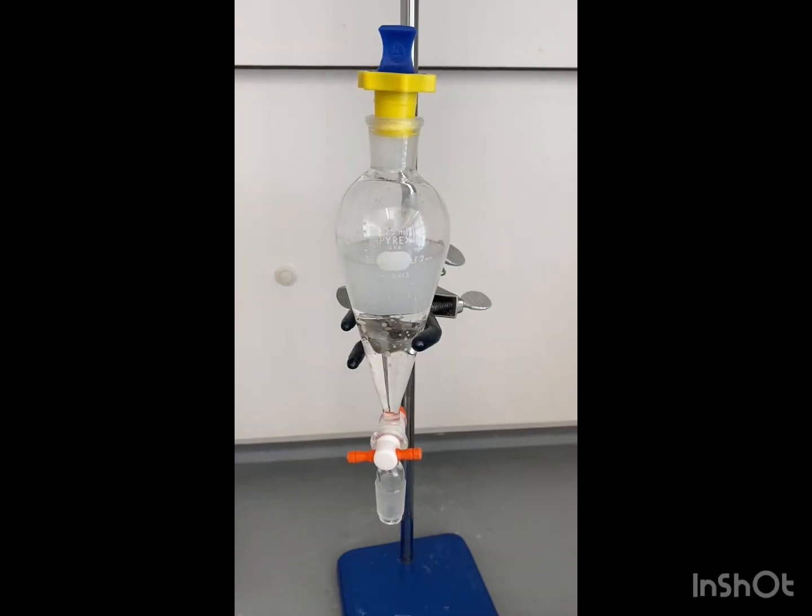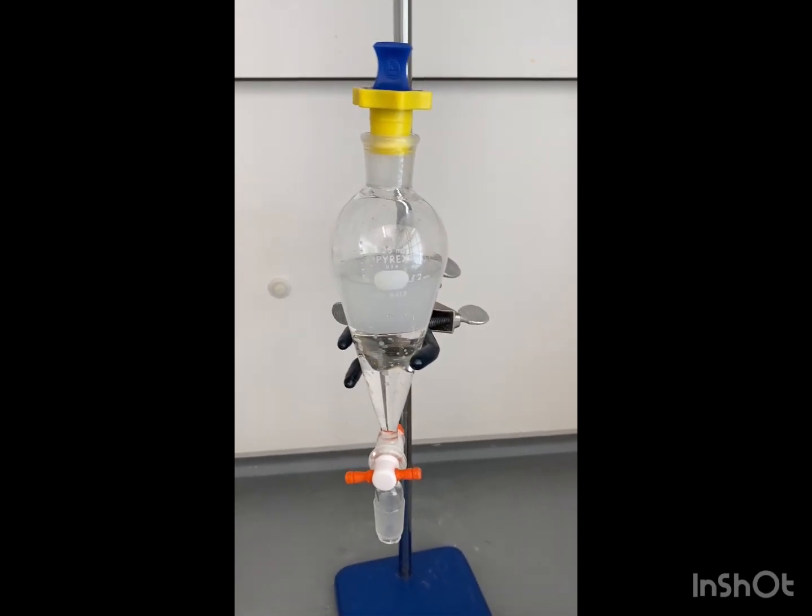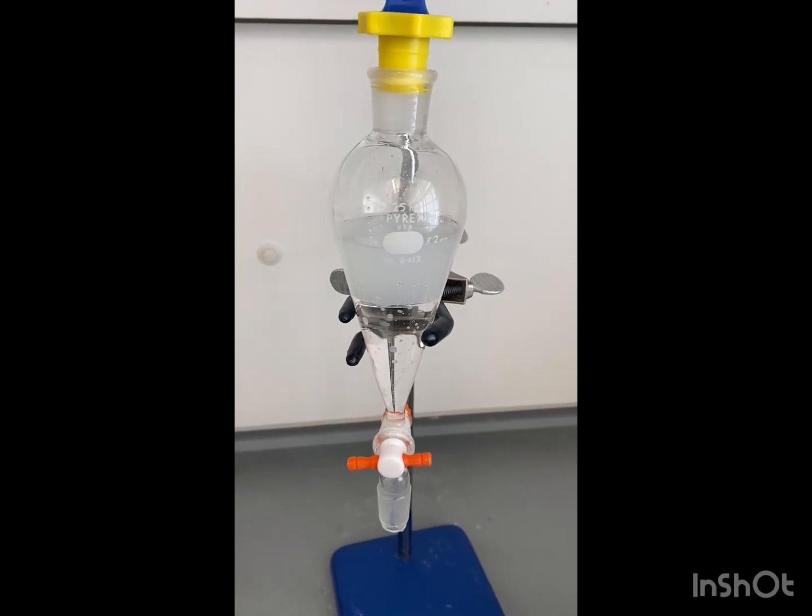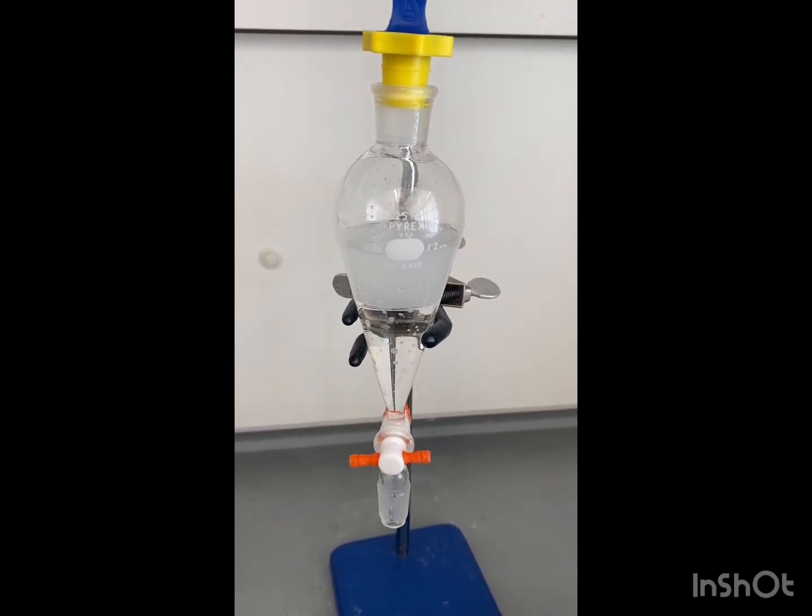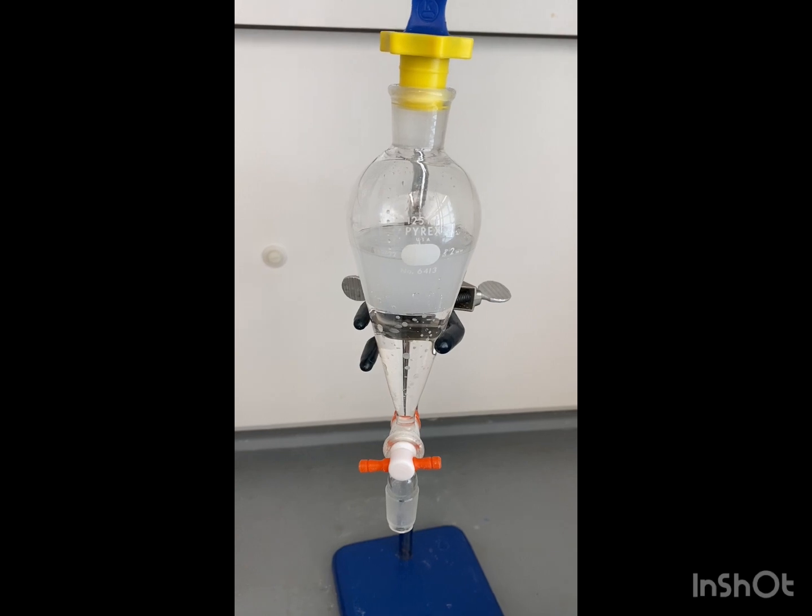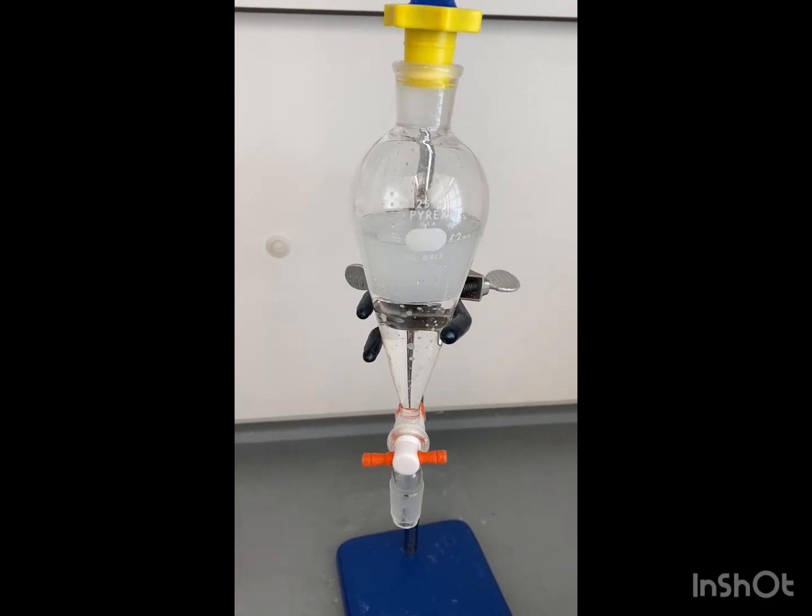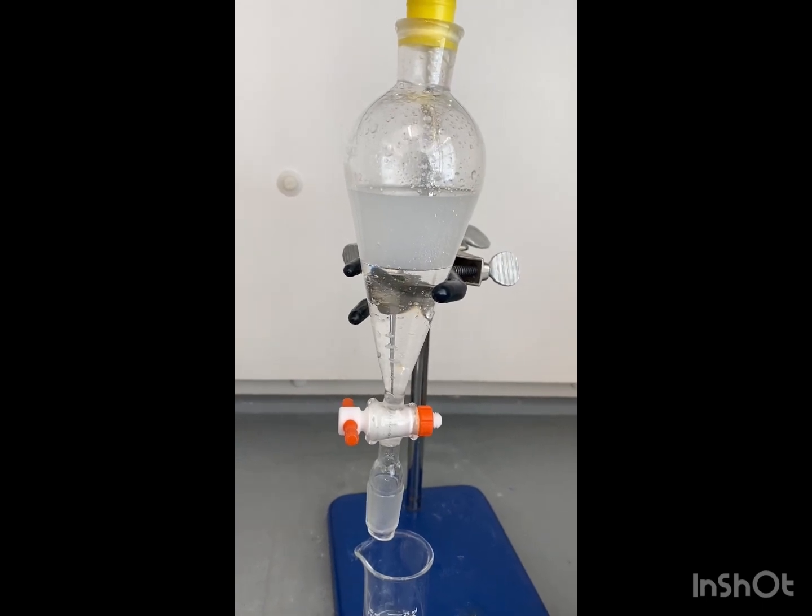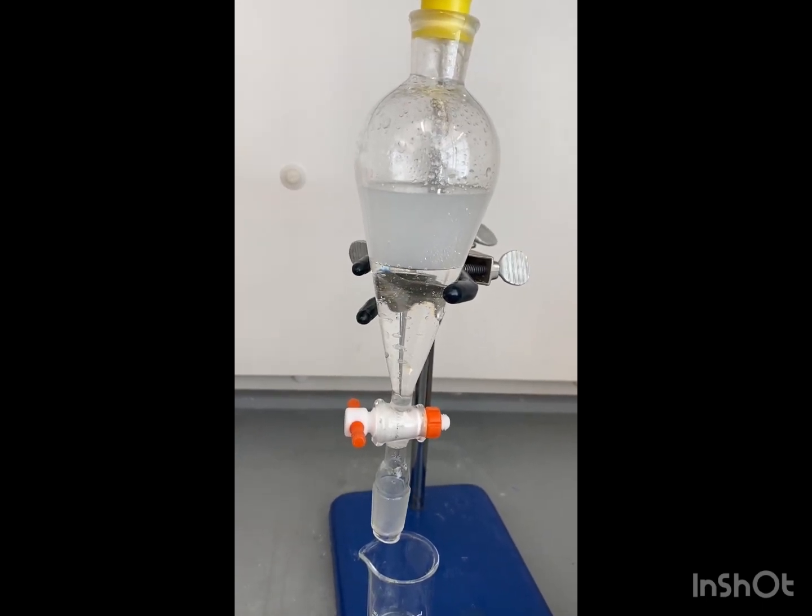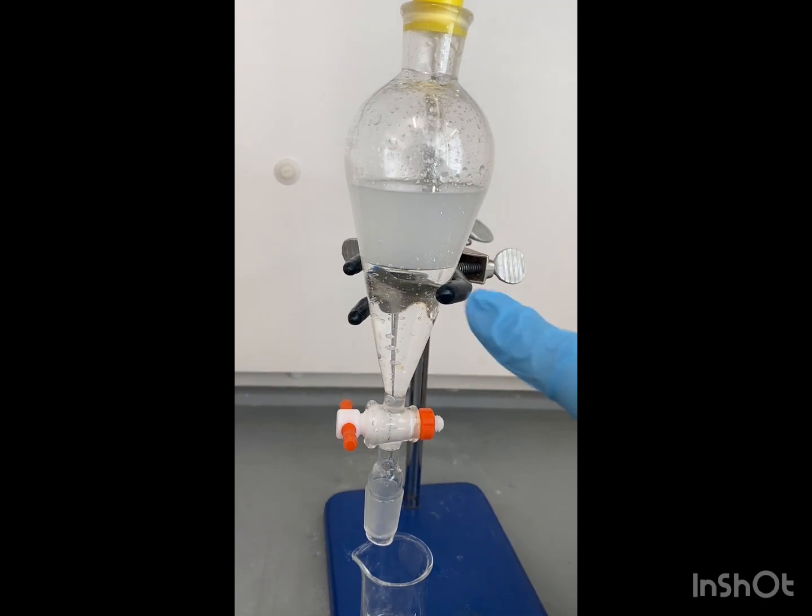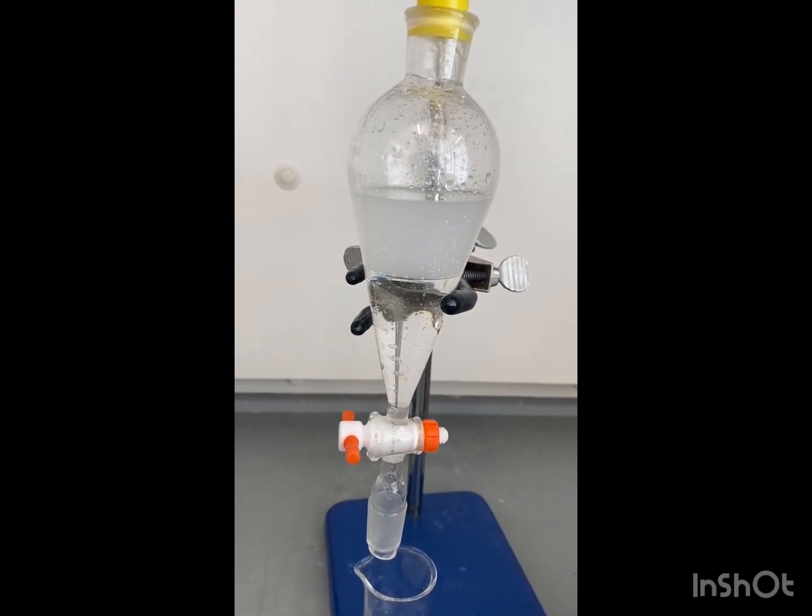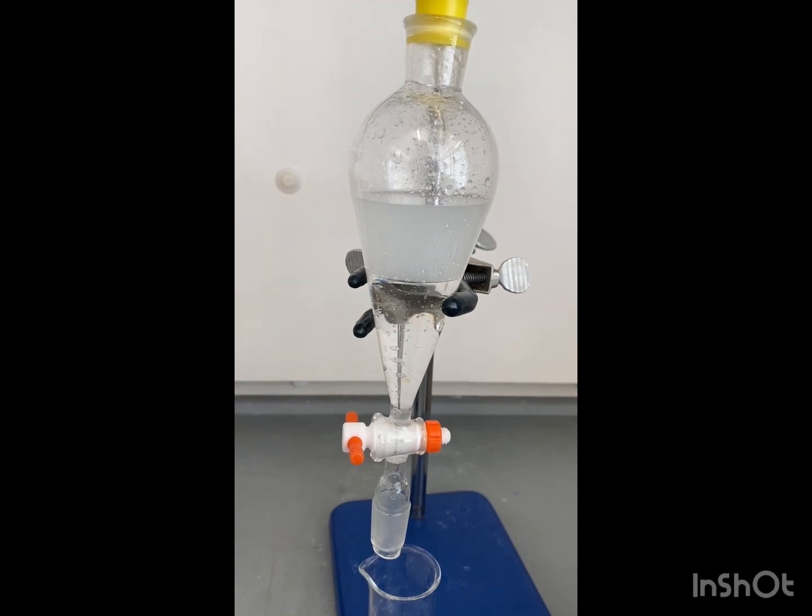Now we're going to separate the cinnamaldehyde from the water using DCM. So I added 40 ml of DCM into our separatory funnel along with our distillate that we got. Now that we have it mixed and we vented it, we are going to extract the organic layer and we're going to do this two more times.